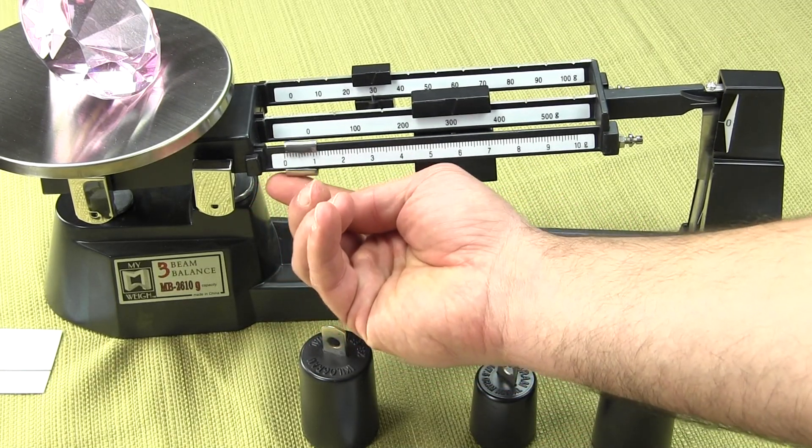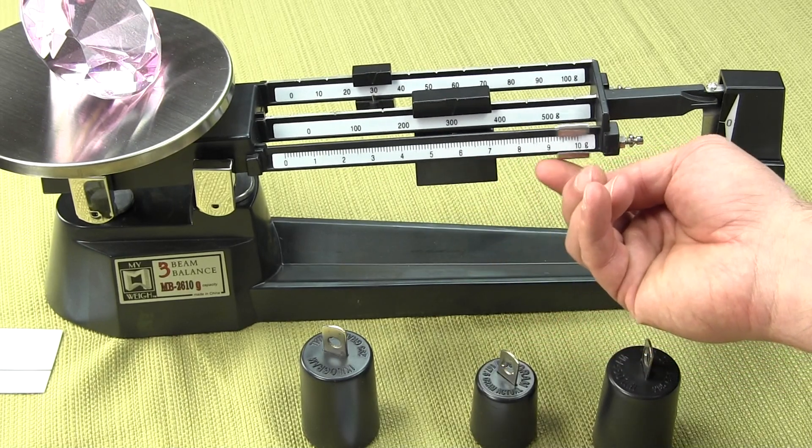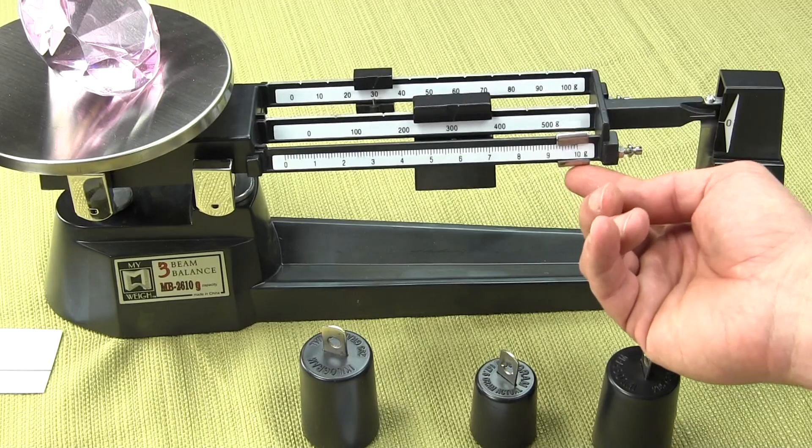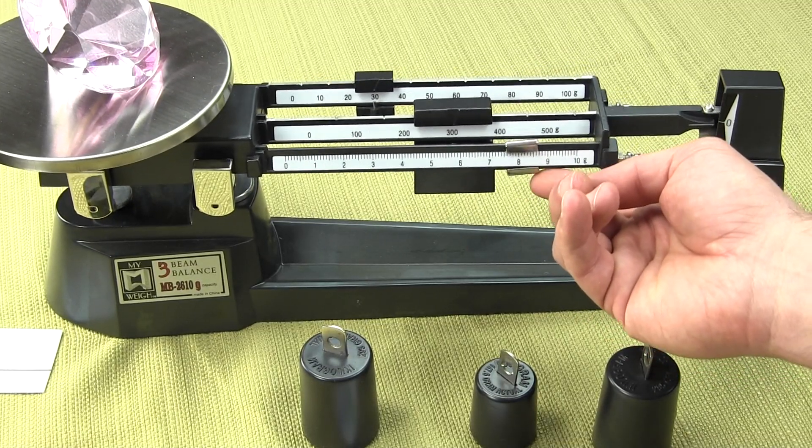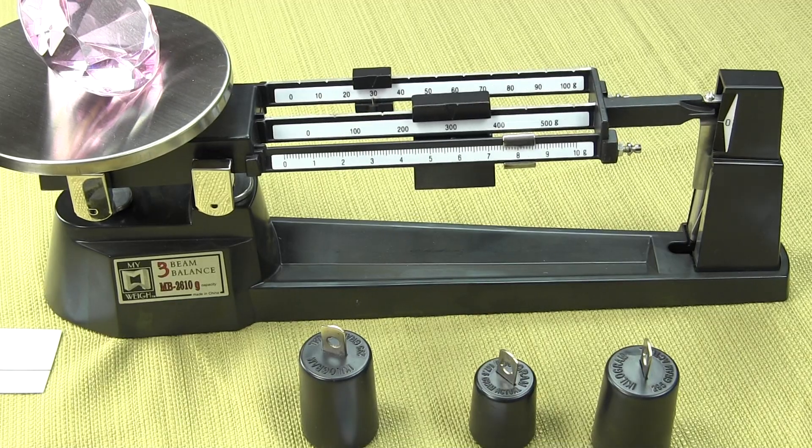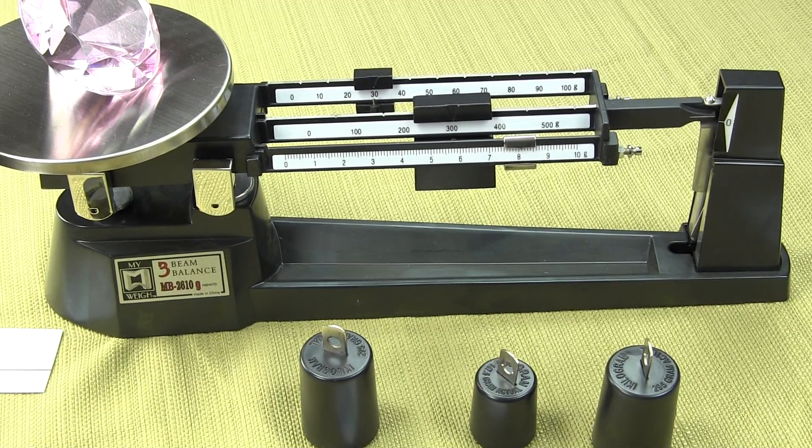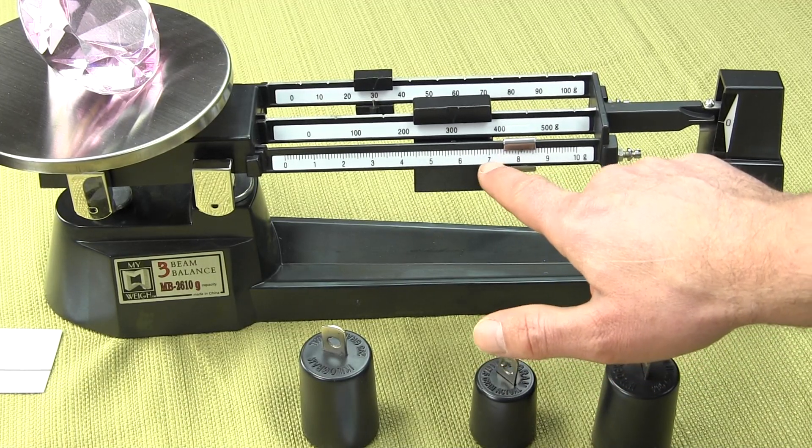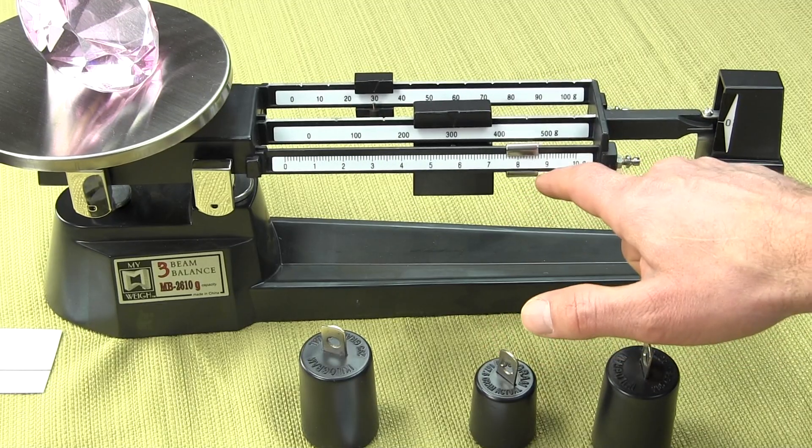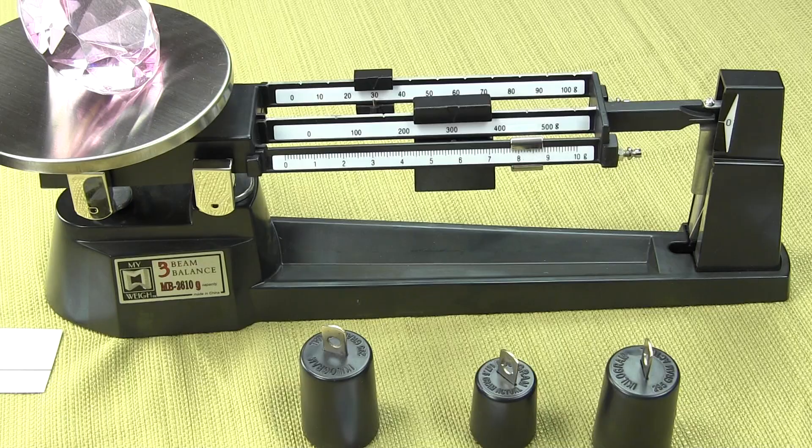Now we want to slide across the front poise. Really, you're supposed to slide it all the way to the end and then start bringing it back until that beam comes up. That looks pretty good right there. It's a little high. The beam is high, so I want to add some more weight to it.